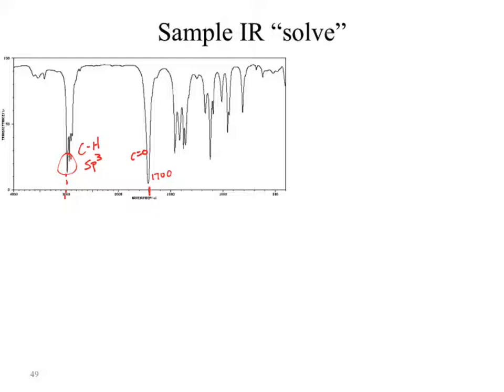How can you ensure you've got it right? Well, just draw a dotted line. Everybody can draw a dotted line or even a straight line that's actually straight. Get a piece of paper, align it with the bottom axis. That is now straight. We have a perpendicular line using the other edge. We line it up with my 3,000. Where are those peaks? They're visible, so they are by definition under 3,000. That makes it CH SP3. I don't have to pull out any fancy tools. I just take another sheet of paper that I have handy.